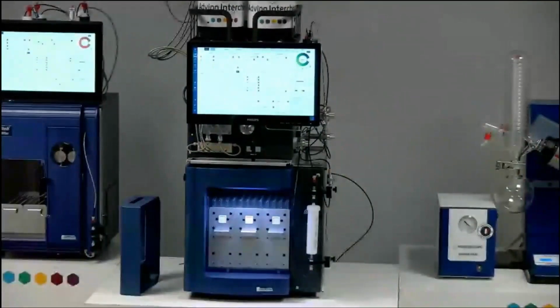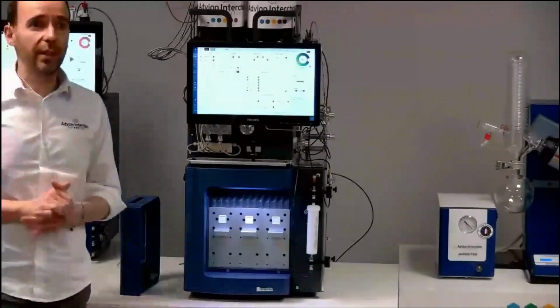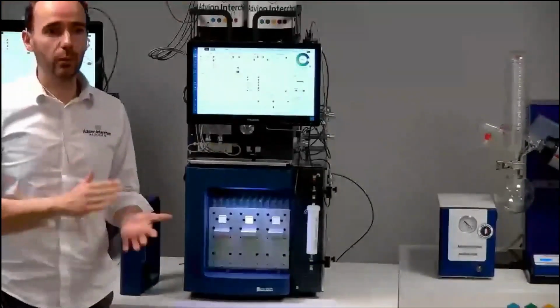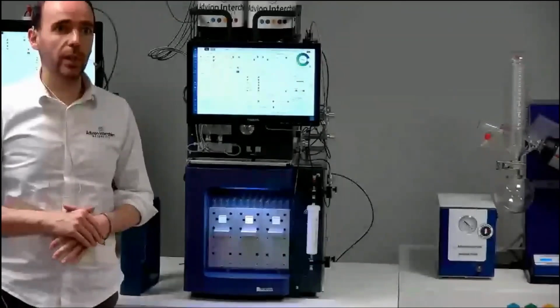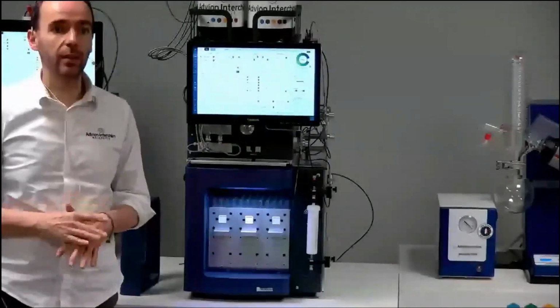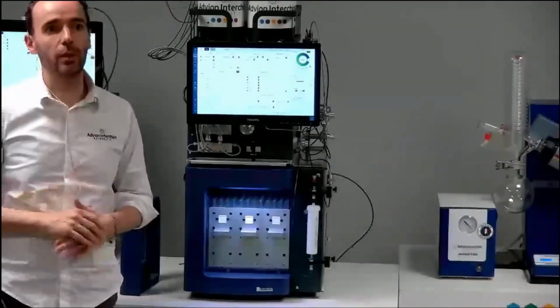Okay, wonderful. Thank you. This next question says, can you please tell me the UV detector range again? Yes. So for the UV, by default, the range is 200 to 400 nanometer. So it's the standard. And in option, you can have the pack UV extended from 200 to 800 nanometer.